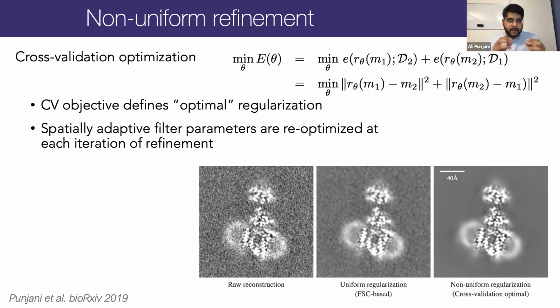with a micelle, the atoms in the micelle are just as real as the atoms in the protein in that single particle image. And they diffract electrons just as much as the protein. We can't ignore them, so we have to treat them differently because they're always in a different configuration from image to image, and that's what regularization is about. But we can't mask them out and just totally ignore them. Hopefully that answers the question.